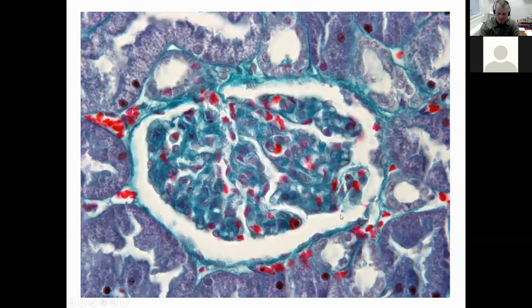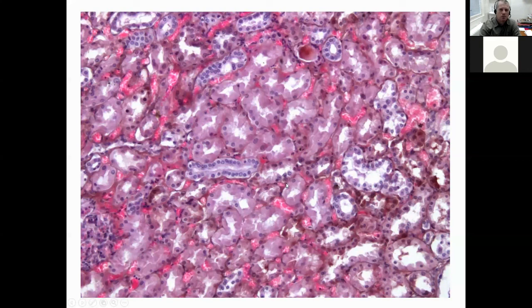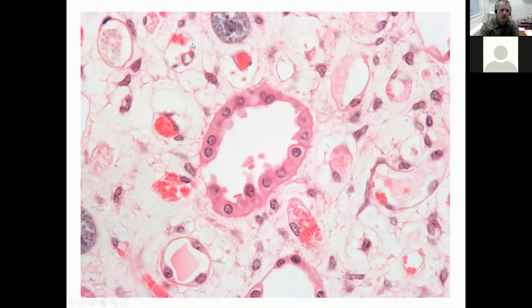This is also a picture showing the renal cortex, the cortex of a kidney, and just to give you an impression how dense the network of the blood vessels is in the kidney. Do you remember that the kidney took 1/5 of the cardiac output? Yeah, 1 liter per minute in an adult. So look how dense the capillary network is, surrounding the tubules of the kidney cortex in this case. So these are all capillaries of the kidney. Kidney is an amazingly highly perfused organ.